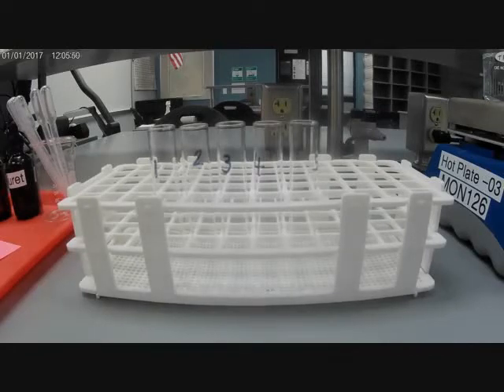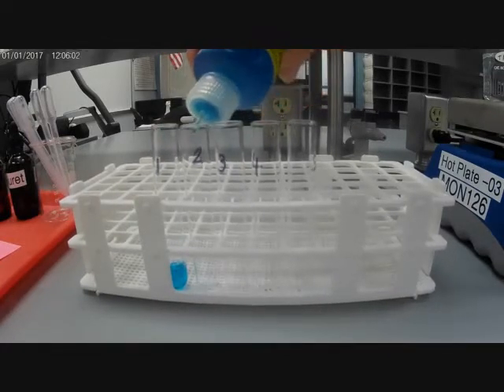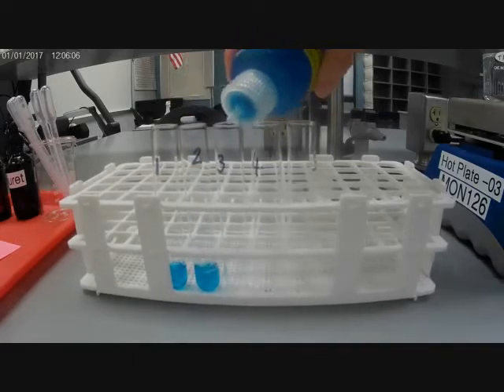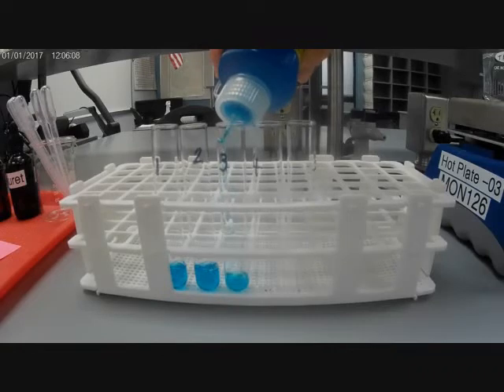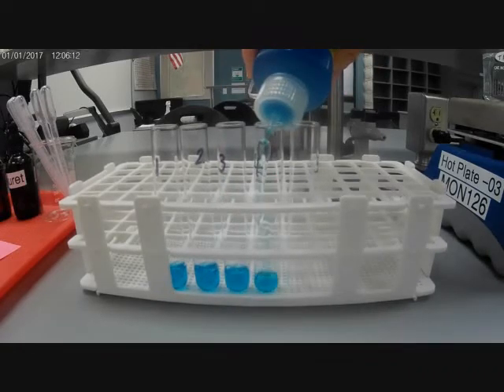All right, so here we are — we're going to be doing our Benedict's test. I have my Benedict's solution right here. I'm going to put about roughly one milliliter of Benedict's solution in each of these tubes. It doesn't have to be exact, so I'm just kind of eyeballing it, making sure there's roughly the same amount in each tube.